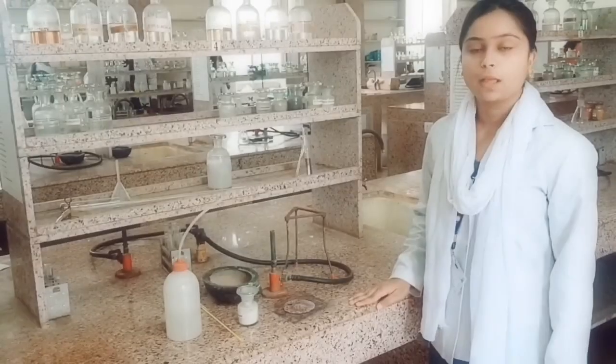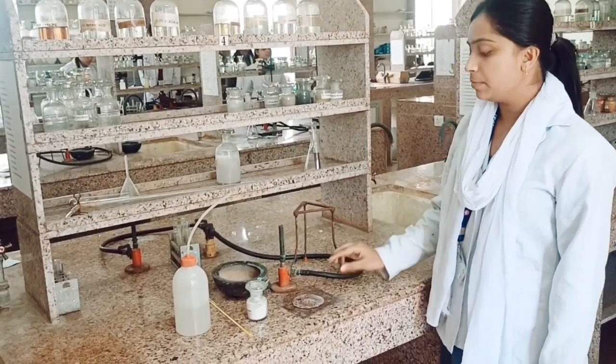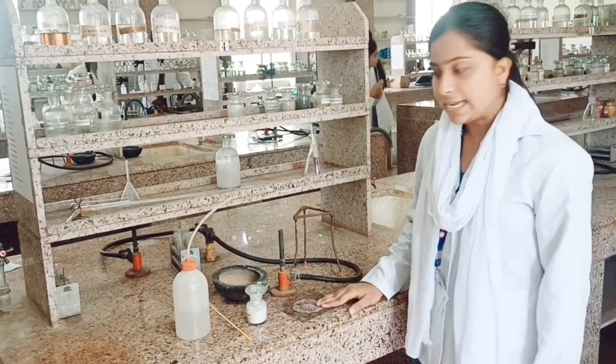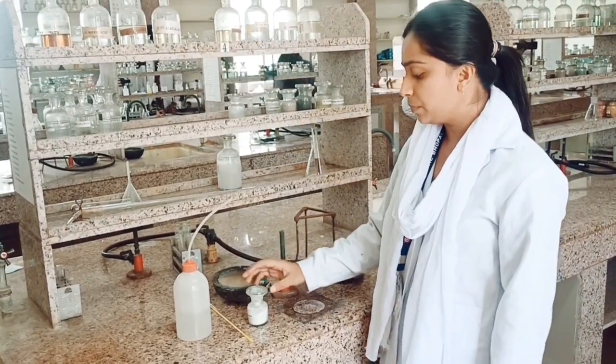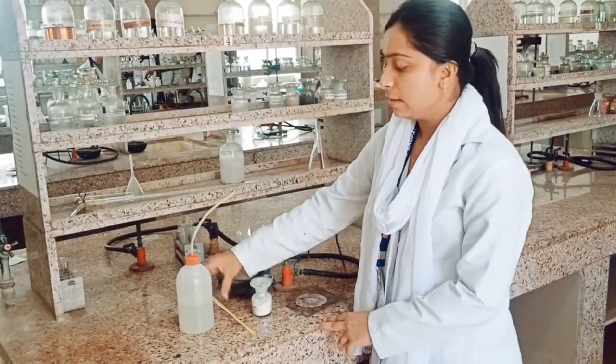The phenomenon of elevation of boiling point is that the boiling point of a solution is higher than that of a pure solvent. The solvent used here is distilled water, and the solute used is an unknown salt. Materials required are a tripod stand, Bunsen burner, iron gauze, water bath, unknown salt, thermometer, and distilled water.